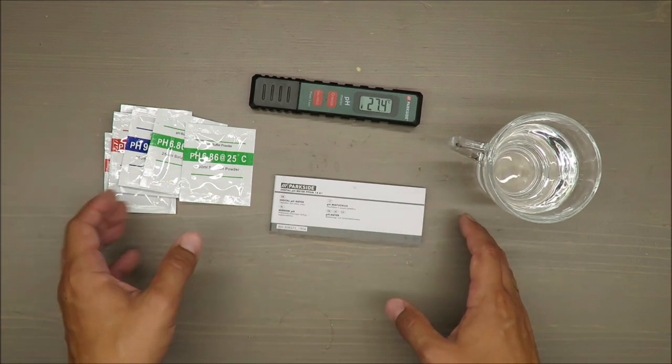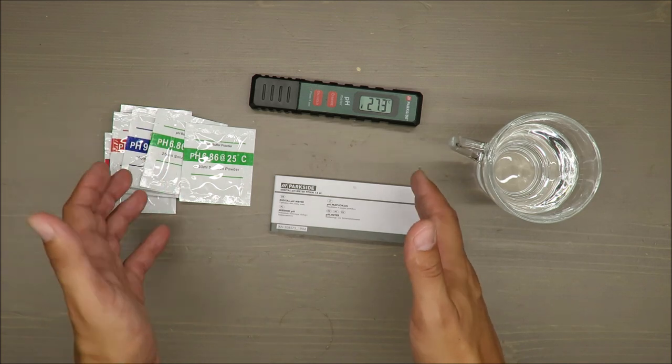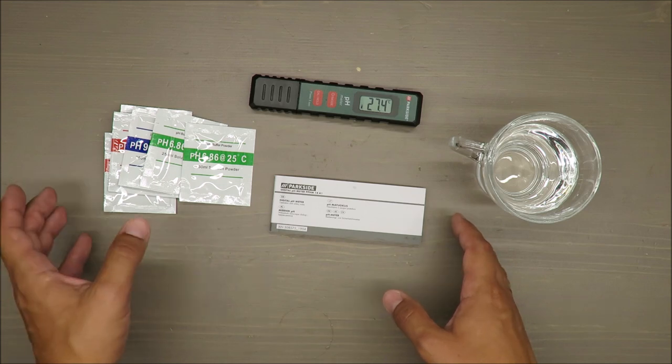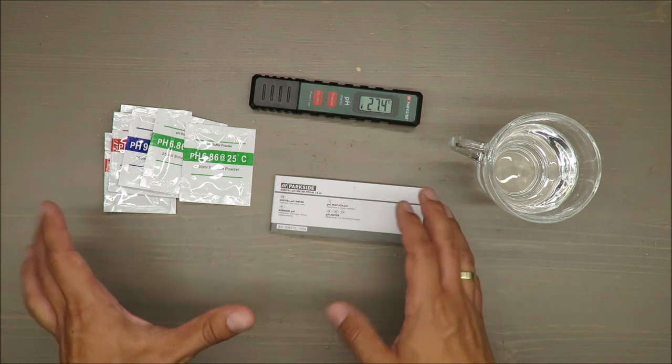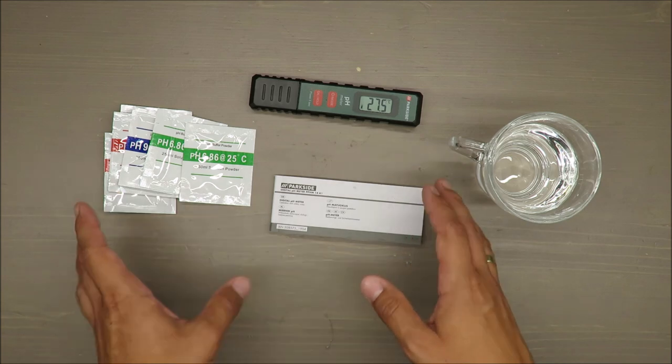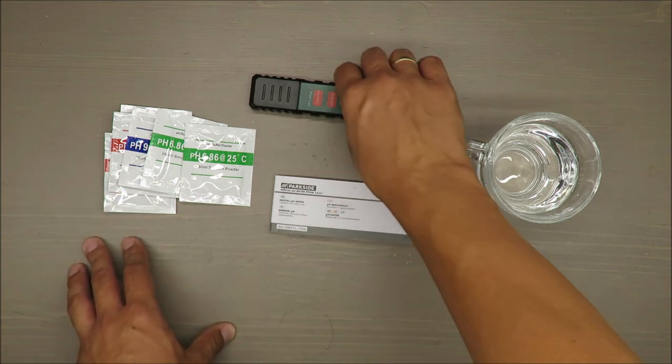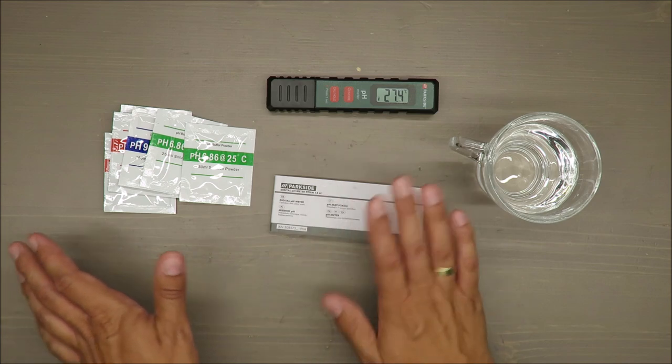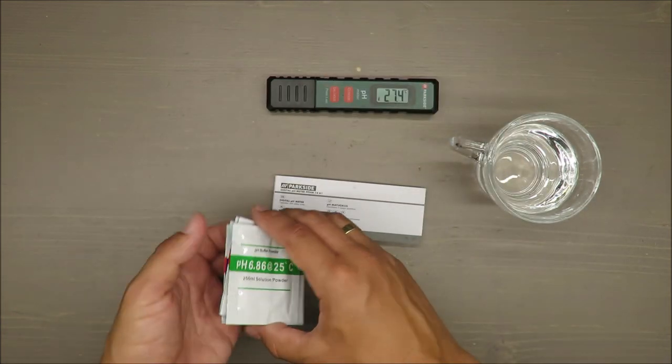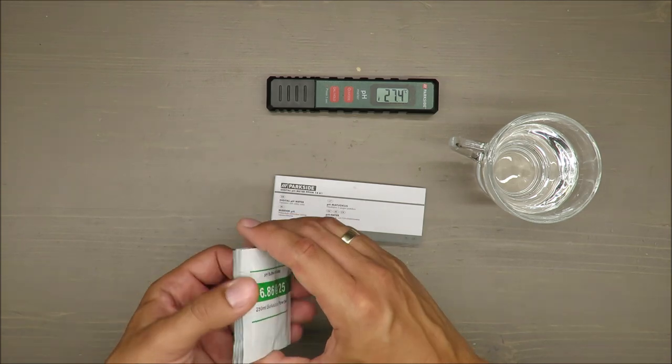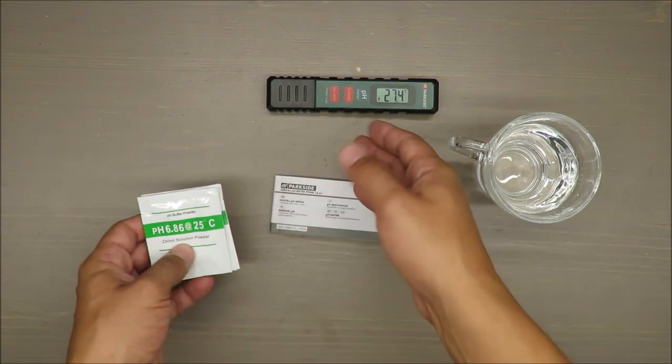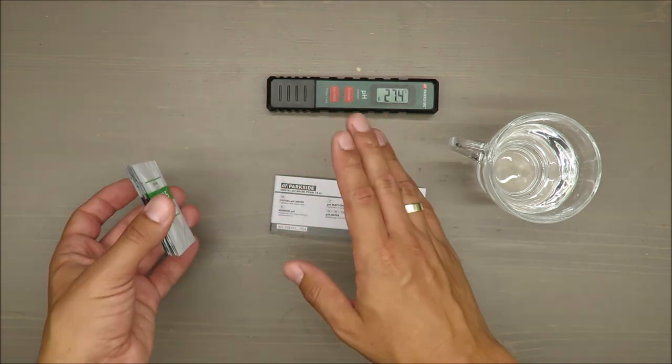On the beginning, one disclaimer: I can barely imagine when you would need such a pH meter in your daily life. For me, it's one of those appliances that's a little bit odd. If you're looking for some kind of gizmos and you want to play with them you can buy it, but for daily usage I can barely imagine a pH meter is one of those things that you have to have at your home.